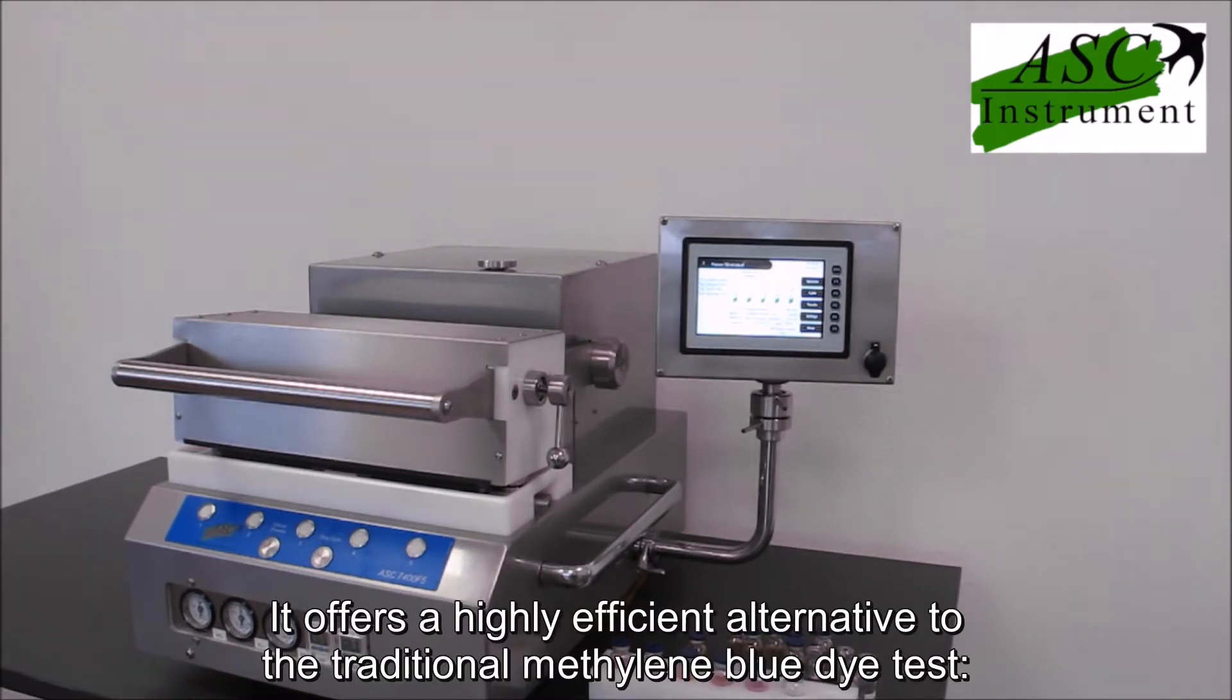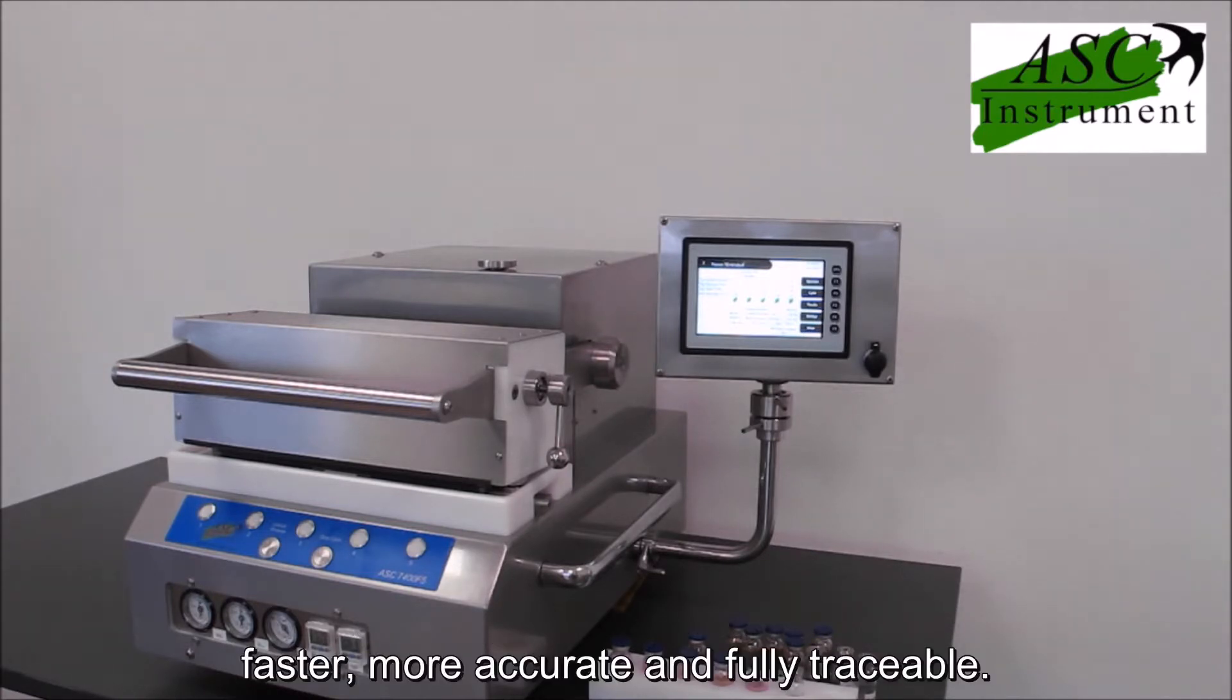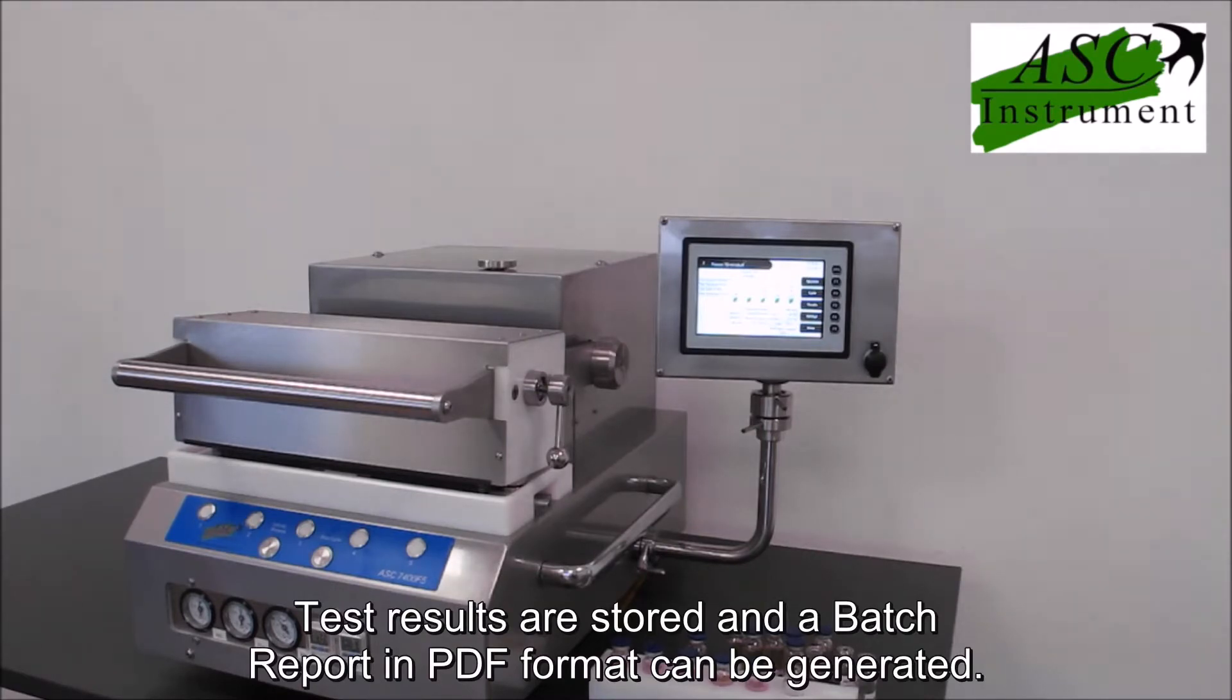It offers a highly efficient alternative to the traditional methylene blue dye test - faster, more accurate and fully traceable. Test results are stored and a batch report in PDF format can be generated.